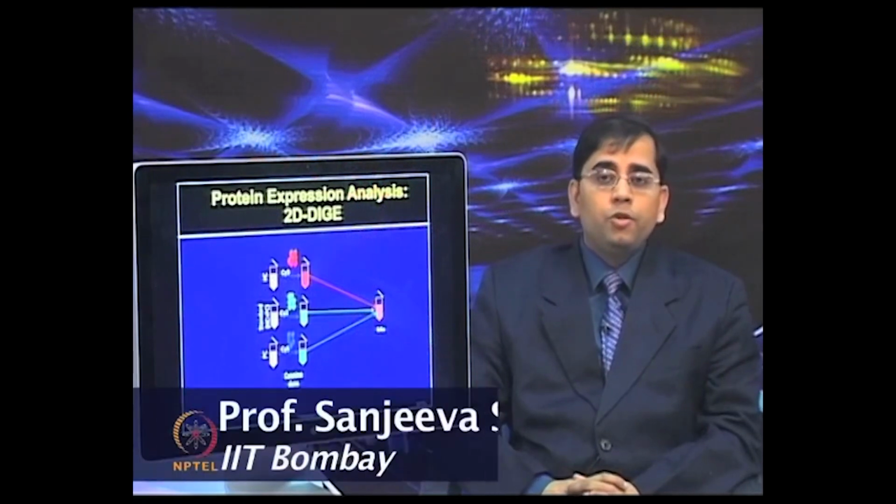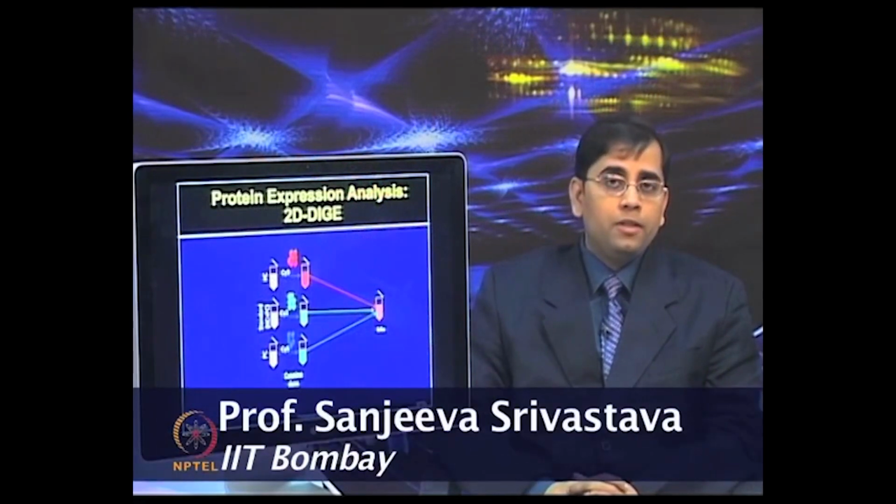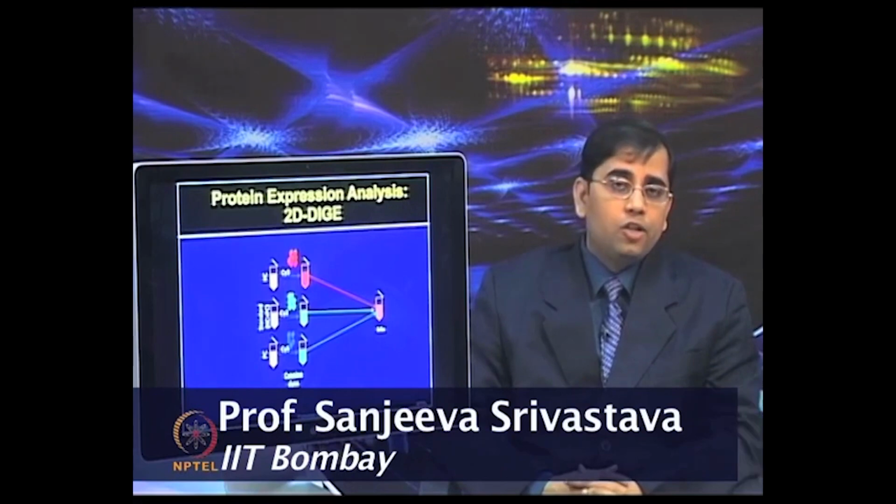So, the differential proteomic analysis was performed in two different cohorts of histologically confirmed prostate cancer with different grades of the disease.